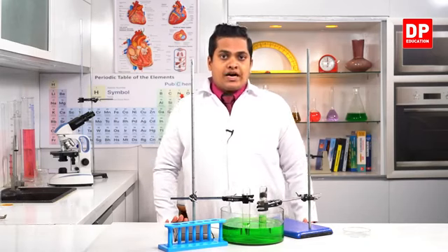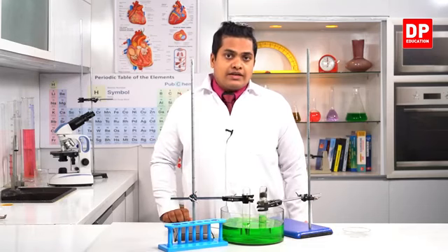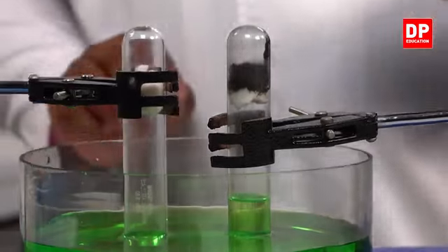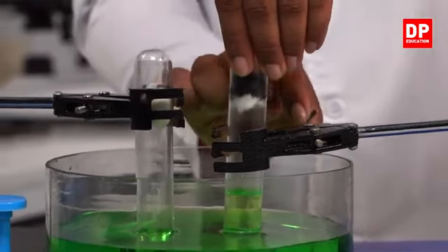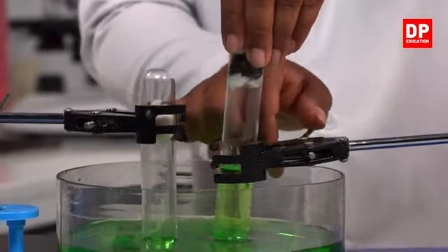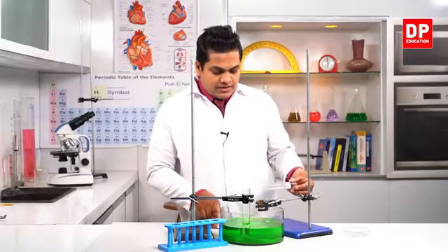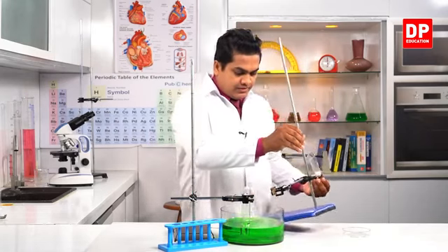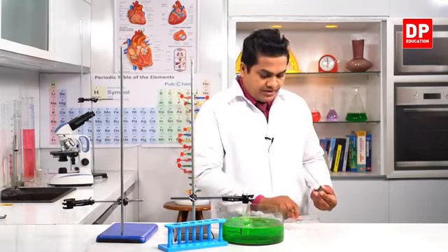Now I'm going to check what has happened to the iron powder or iron filings inside the boiling tube. So I'm going to remove this system gently, take out the boiling tube, keep the stand, and take this petri dish.